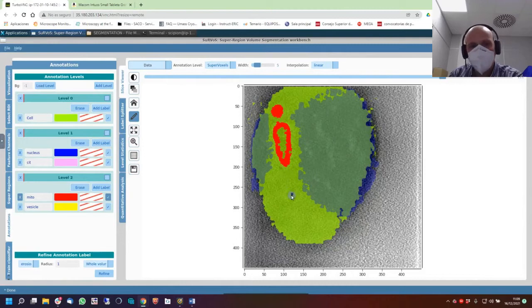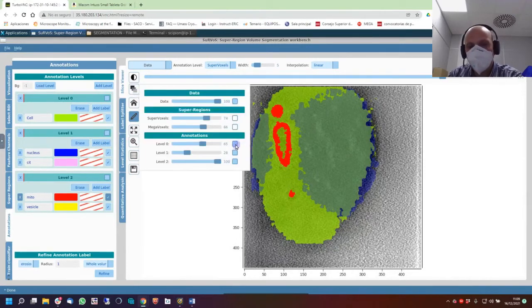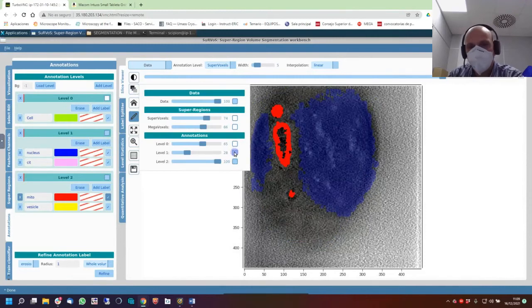And if you don't want to be disturbed by this, it's easy. We can click. And you will see only the mitochondria.